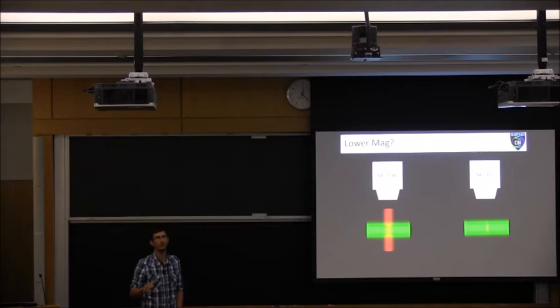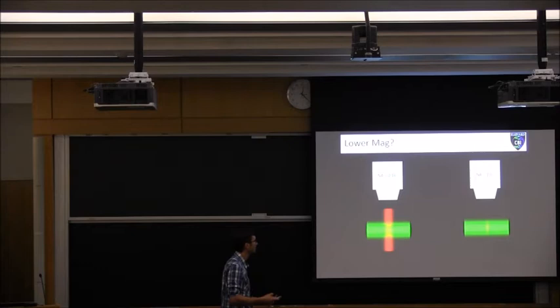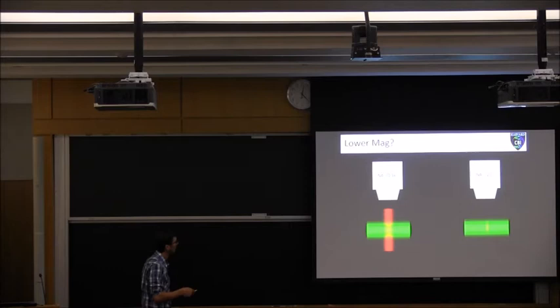So if you ignore the green stripe for now and just look at the red stripe, this is a representation of the focal point of those two objectives. Okay? So with a high numerical aperture objective, and this is in the Z dimension, we get a really nice tight point spread function here. Okay? On the other side, when you go to this low numerical aperture, you can see we have this massive PSF that I've actually cut off the top and bottom of it just because it was so big. There's no point in showing it all.